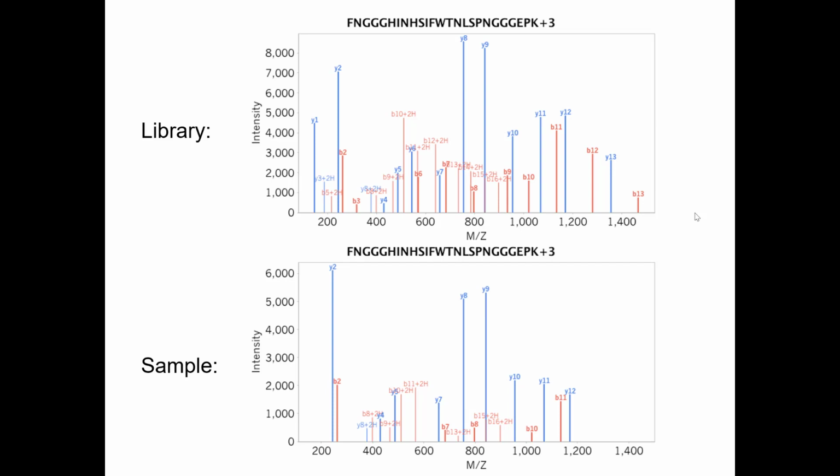What's the likelihood that Y2 is the same? Let's start out here. What's the likelihood that any spectrum has a Y1 for 147? That's lysine. It's like probably half of them, right? Half of peptides have Y1. So virtually, given that we typically see around 20 peptides per sample at any given scan time, every scan is going to have lysine Y1. Every scan is going to have arginine Y1. So Y2 actually is selective only 20 times that, right?